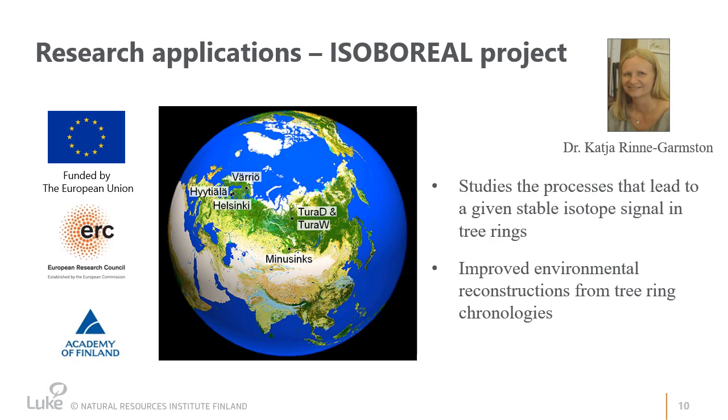The analytical method for high-resolution carbon isotope analysis was established and has been used at Stable Isotope Laboratory of LUK during my ongoing Isoboreal project, which is funded by ERC and Academy of Finland. In this project, we are interested in the processes that lead to a given stable isotope signal in tree rings.